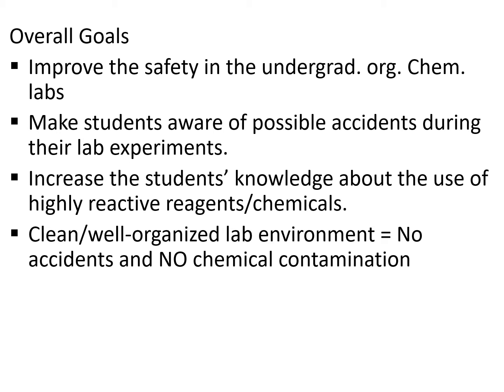All right, some basic overall goals for this presentation. We want to basically improve the safety for any undergraduate organic chem labs. There's always issues with broken glassware, little tiny injuries. Luckily with students we haven't had any severe injuries, but we want to keep it that way. So we want to make sure you're aware of any possible problems that might occur during a lab, increase your knowledge about the use of the chemicals and reagents you're going to use during labs, and make sure you're able to keep a clean and well-organized lab environment, which hopefully will lead to no accidents or chemical contamination.